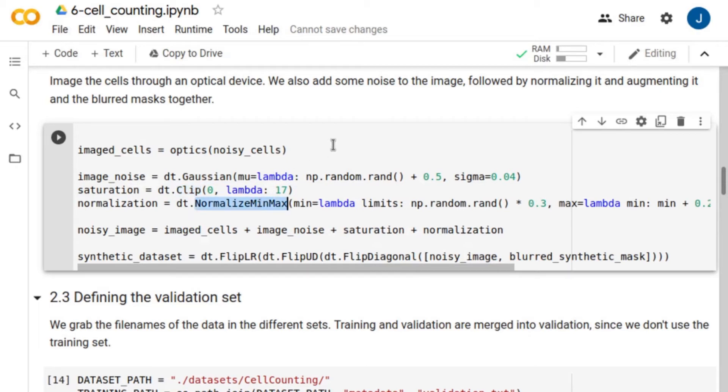Note that we use random normalization limits. We found that doing this helps the network to generalize better with images of different sizes.